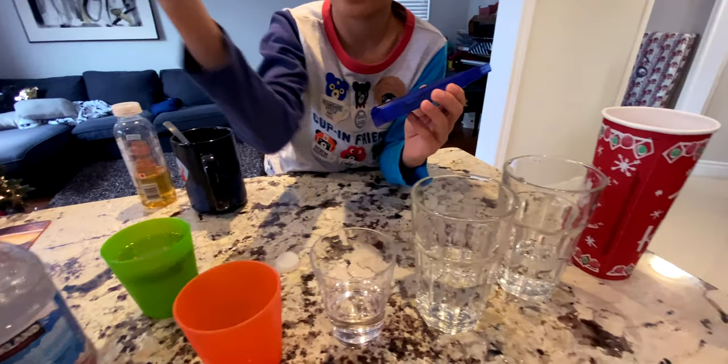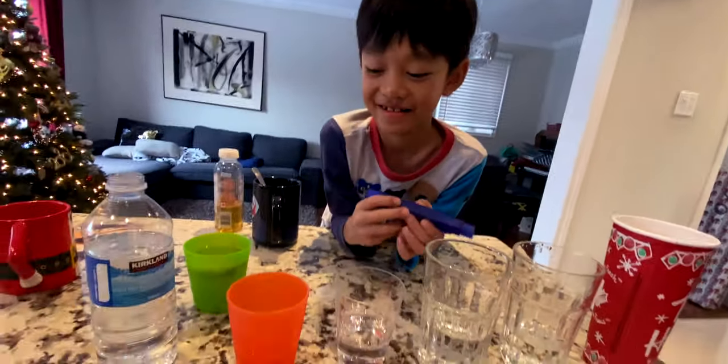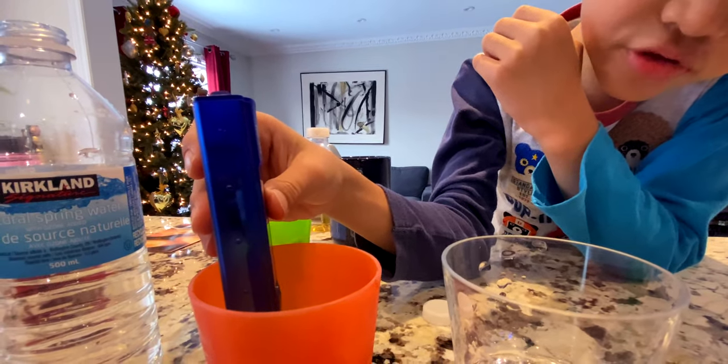Pour this in there. You should do this test too because it's very interesting. This is the drinking water bottle — let me see. Holy, it's 379!